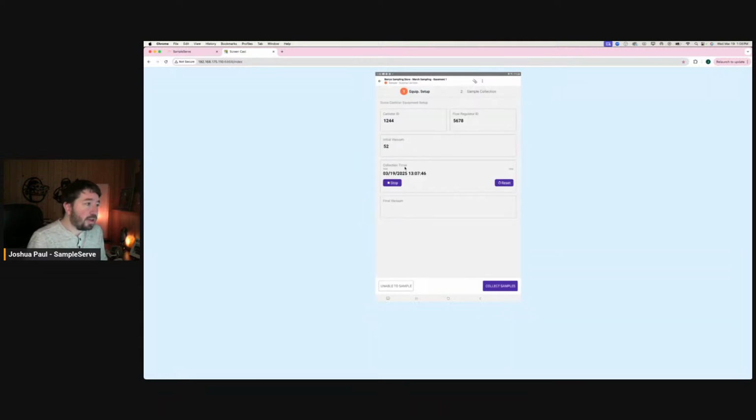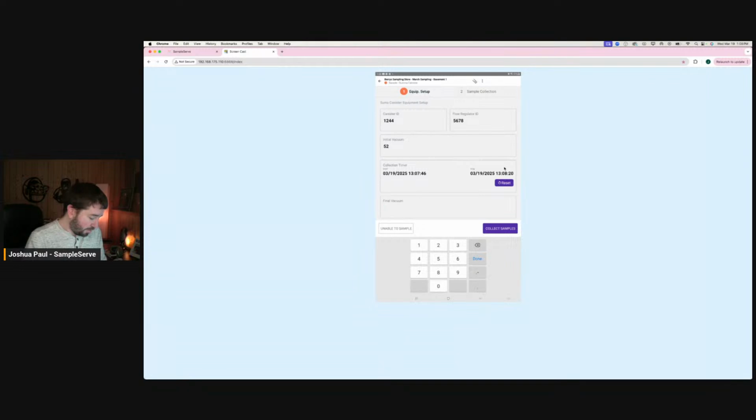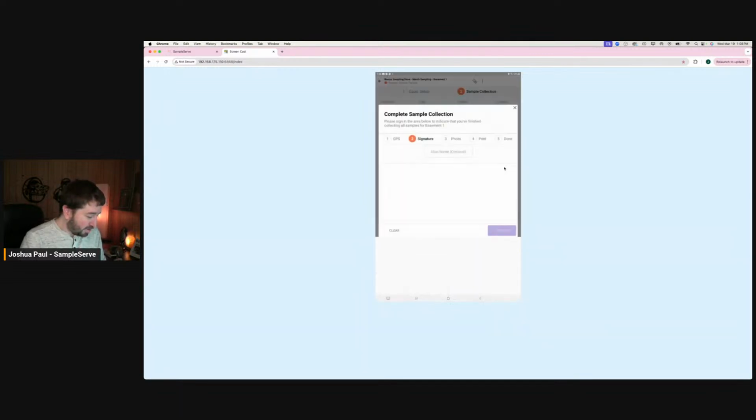And then here, all I have to do, let's say it's the next day, 2 days later, hours later, doesn't matter, I can hit stop here. And now it'll document the start and stop time. And then let's put in our final vacuum, 46. I'm not a vapor sampling guy, so these numbers that I'm making are completely made up right now. So let's collect these samples.